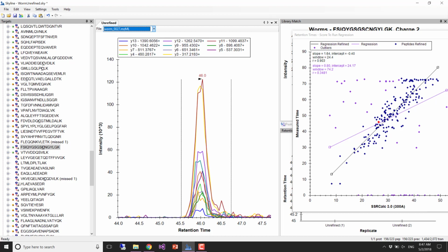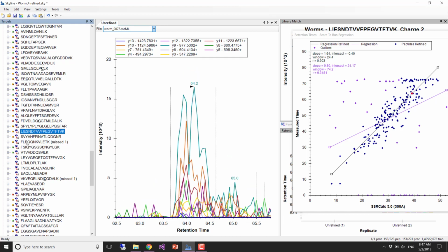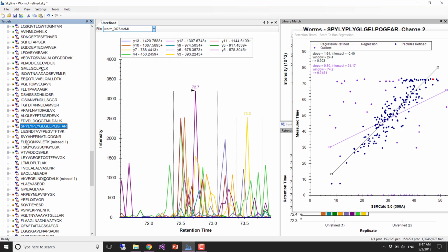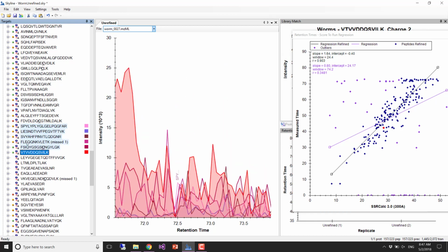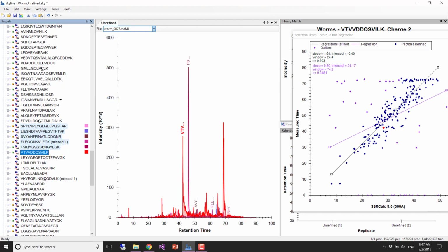We have no measurements of the ones below, and actually, each file, so you can see files 27 and 28 contain these, so they have replicate measurements of these 6 peptides, and we're missing measurements for these 7 peptides. So what happened? Yeah, so 27 was run twice.